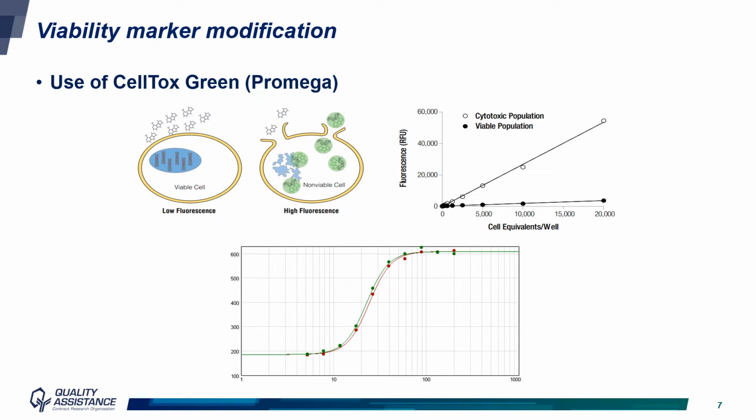After a new step of development, optimal conditions were a culture of 20,000 SKBR3 cells per well in the presence of Kadcyla, from 5.2 to 200 nanograms per ml with a 1.5-fold change. After 72 hours of culture, revelation was performed using CellTox Green dye.